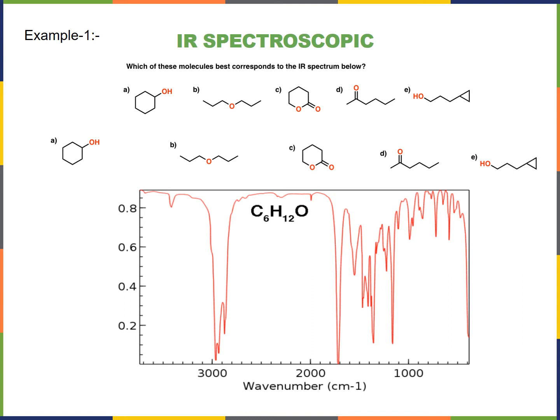Granted, this is a relatively simple example with only carbon, hydrogen, and oxygen, but the process is what's important. This rule may guide us so that, within a given choice of compounds, we can easily identify the carbonyl group, the OH group, and the index of hydrogen deficiency. Let's take one example as a tip.